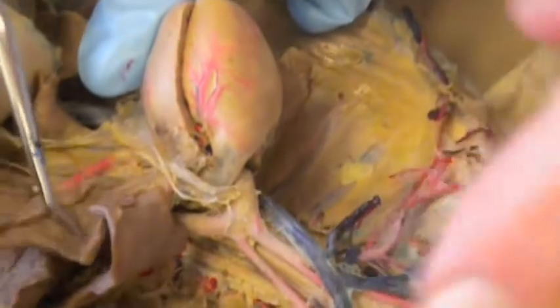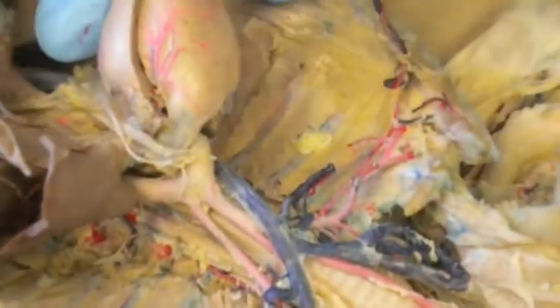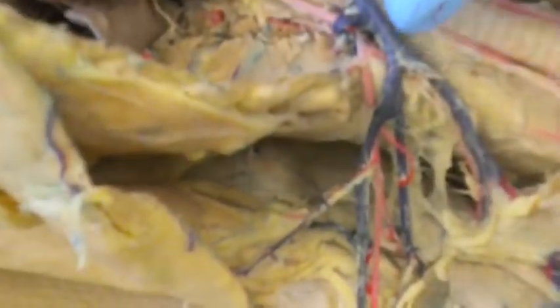I'm assuming you know all veins are blue except the pulmonary because of the oxygenation. If you see a blue one going in, then that's a pulmonary artery. So I just see red ones, but if you saw a blue one there, that's what it would be. Like you see a little blue right there in that. Yeah. That'd be a pulmonary artery. Yeah. So if you look at some of the other cats, you'll probably see something.